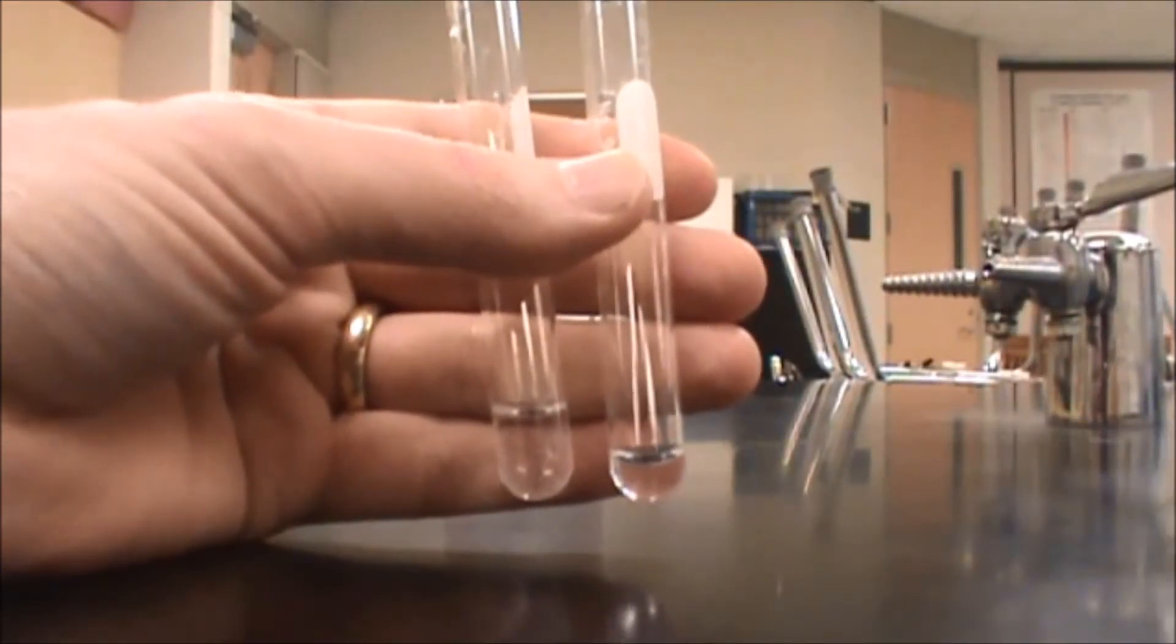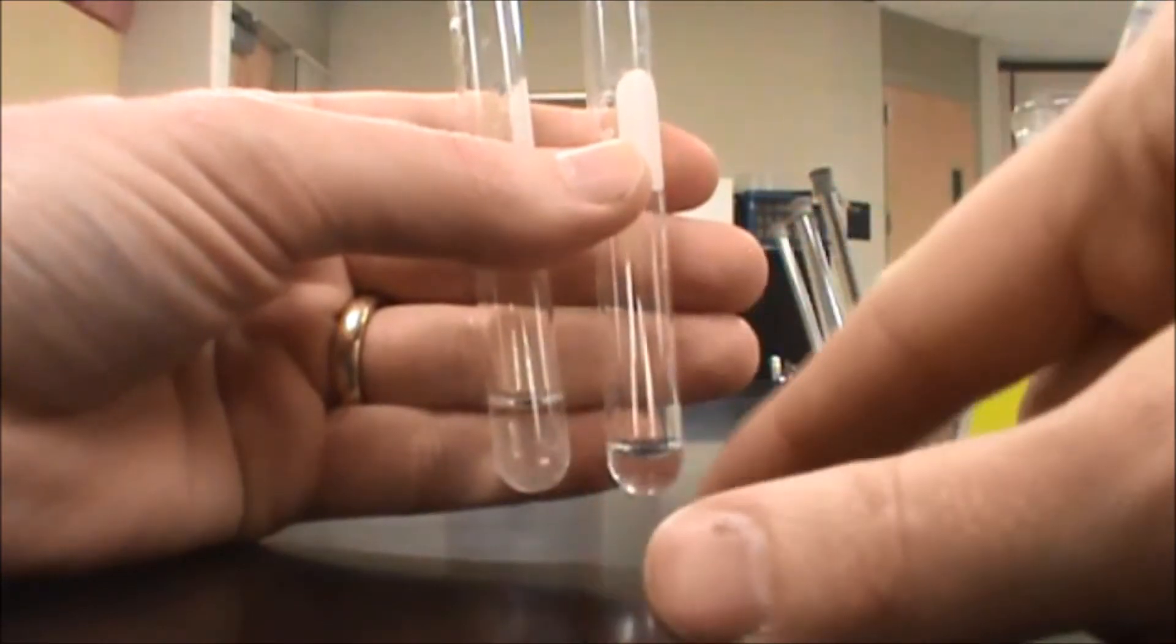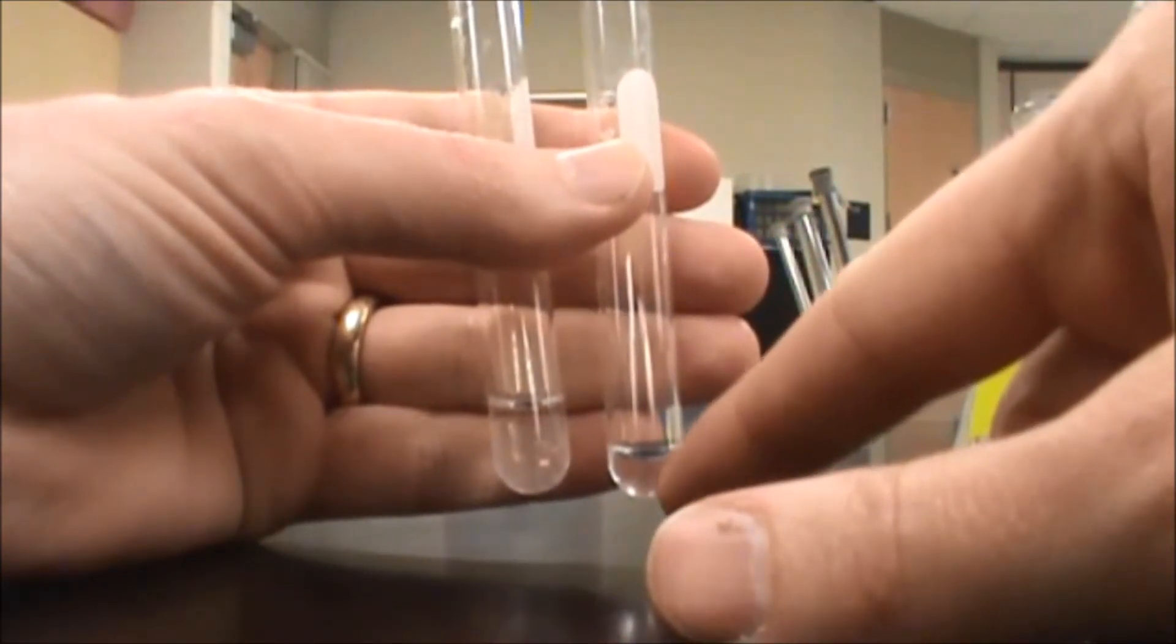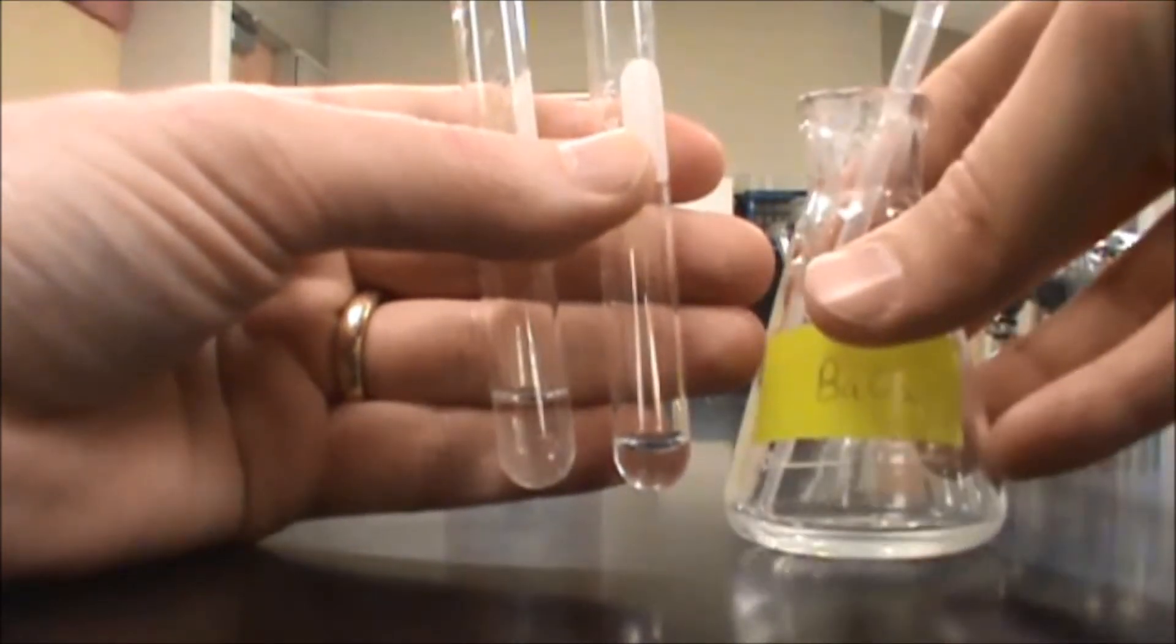Here I'm going to show you how to do the sulfate test. So what I've done is I've put some aluminum sulfate into here, and this is my unknown. In this case I think I used carbonate for my unknown, and I'm going to add barium chloride to each.